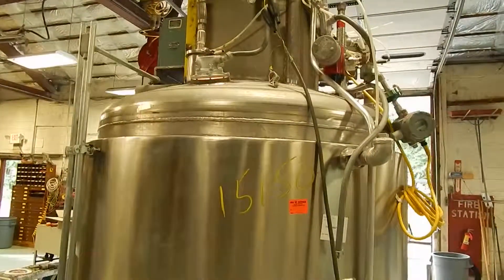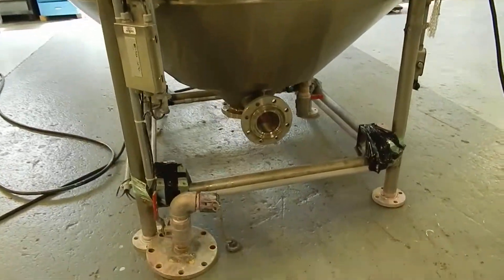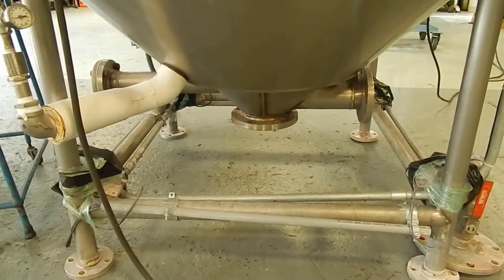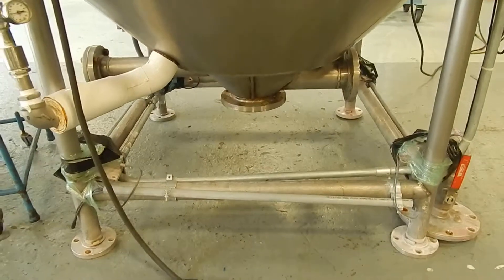All the original controls are mounted on it. The unit has a center-bottom discharge with two supplementary discharges mounted opposed to each other, for perhaps circulation or adding ingredients during process.